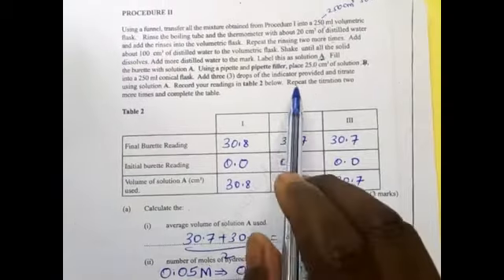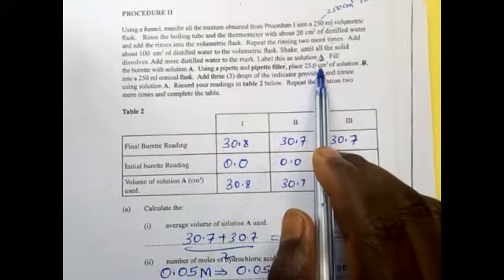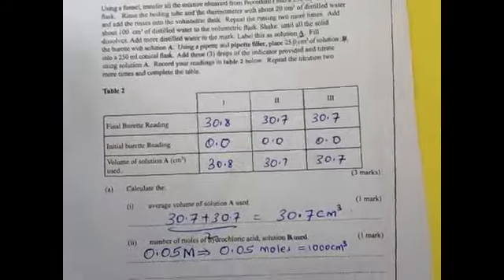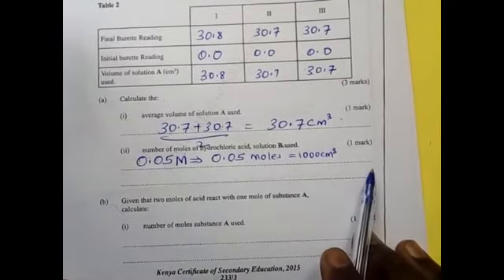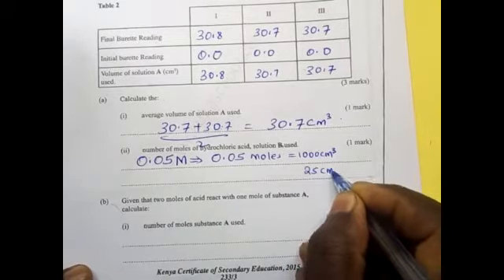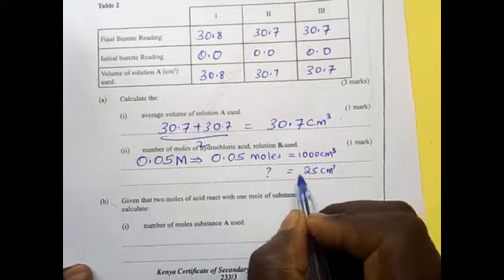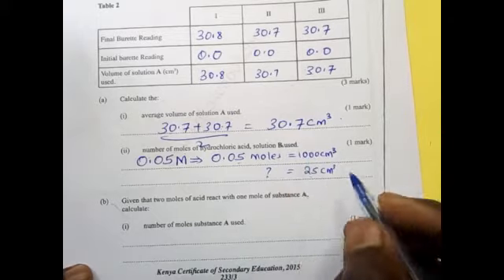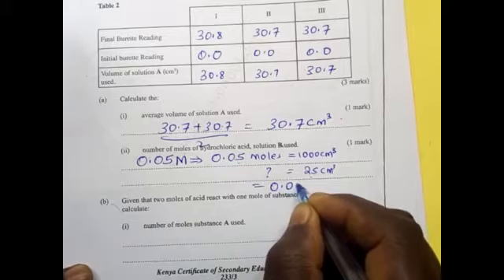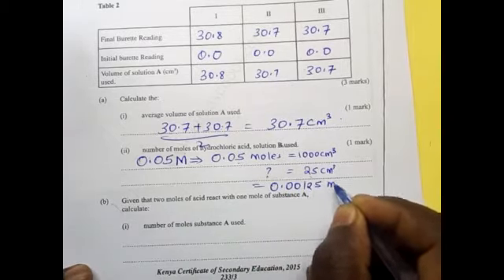We come back: using a pipette, 25 centimeters cube of solution B. So we ask, 25 centimeters cube will contain what number of moles? So this times this divided by this. That will give you 0.00125 moles.